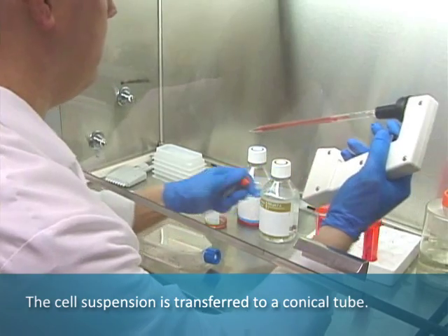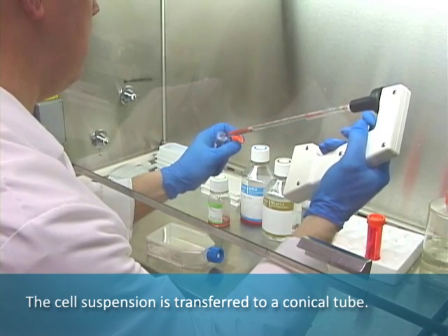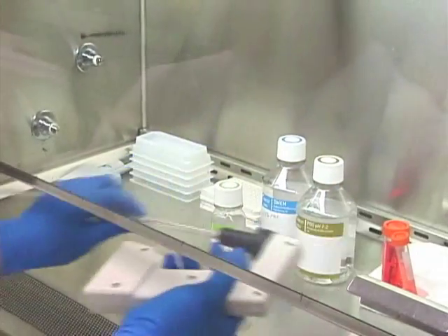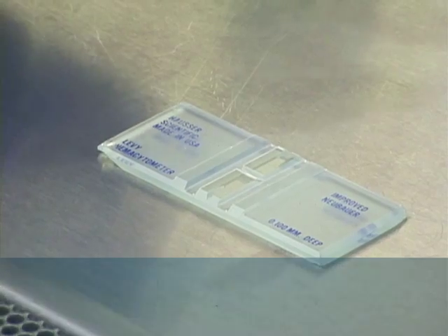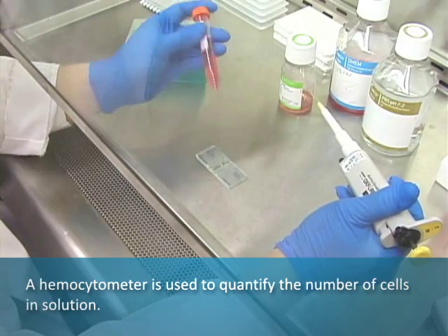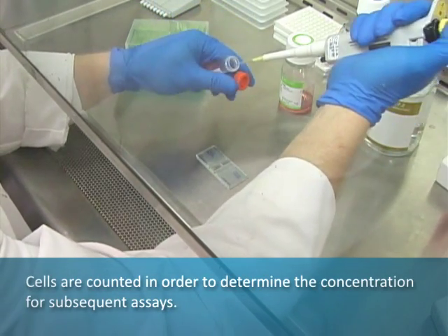The cell suspension is transferred to a conical tube. A hemocytometer is used to quantify the number of cells in solution. Cells are counted in order to determine their concentration for subsequent assays.